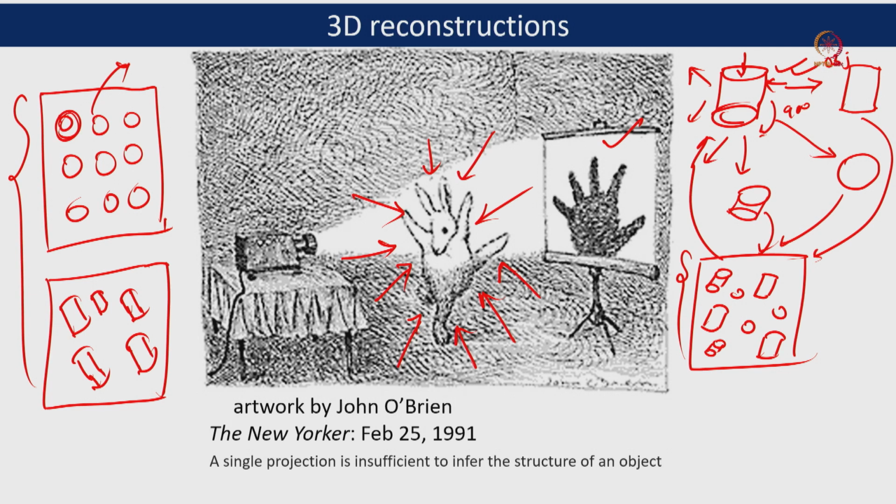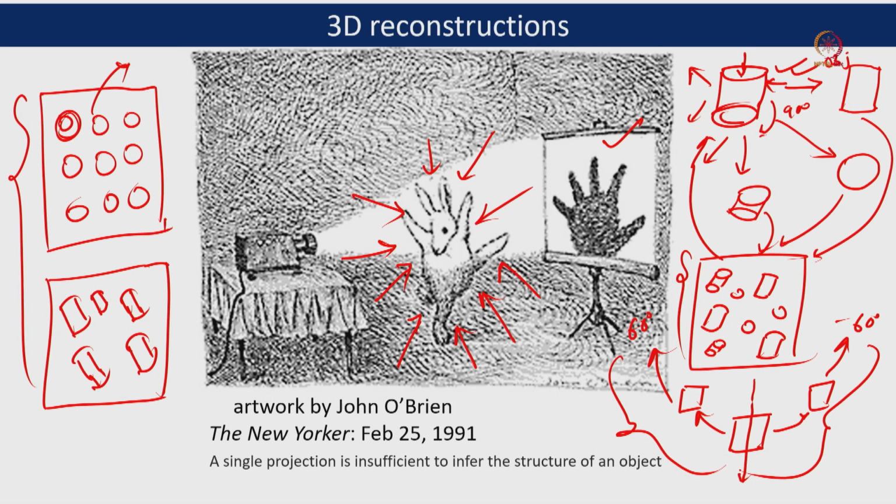So if we look at this sample in particular, we have a sample here, and then we tilt the stage. We are physically changing the position of the grid, keeping it at the same axis, and then we are collecting the tilt images. We will tilt the stage almost plus and minus 60°, and we will add all of this data together to get a 3D volume out of that. So this is called tomography.